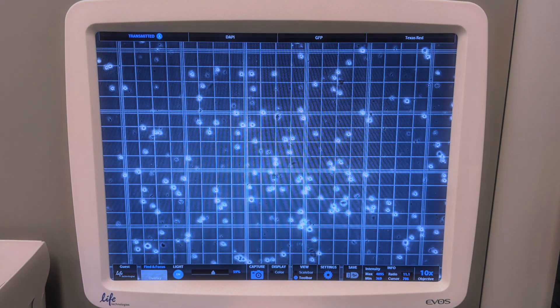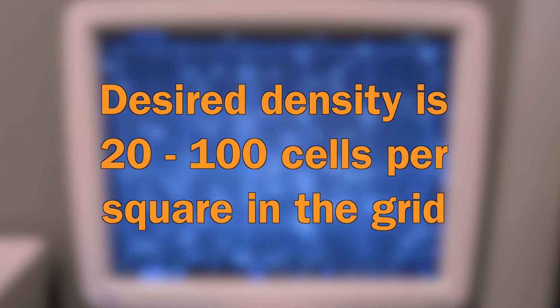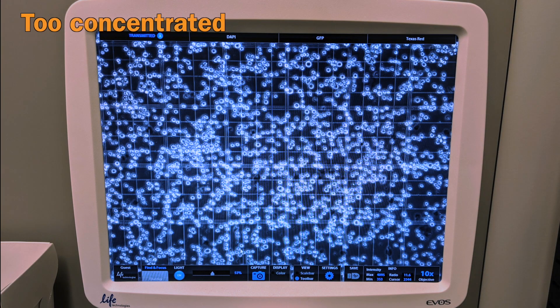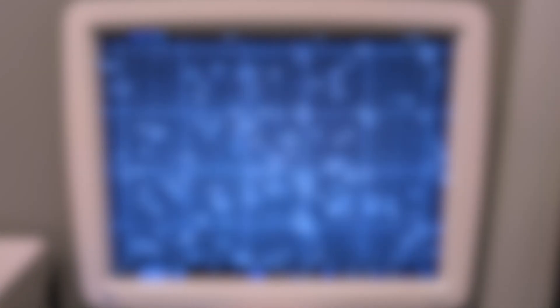For an accurate count, you'll want to have somewhere between about 20 to 100 cells per square in the grid so that the cells can be easily distinguished. If your suspension is too concentrated, you may dilute it and account for that later in your calculations. Repeat this counting procedure for the next square and several more squares if you wish.